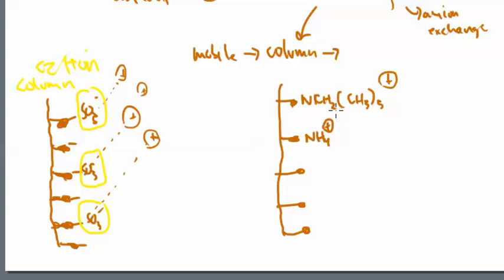And if you aren't happy with that, I'm okay with you doing this number. So put an R there for random group. Typically, these are very small R groups that get sandwiched onto the nitrogen, and hence that's why we see a CH2 group with 3 CH3 groups on there. Okay, so there's the basics of anion chromatography.